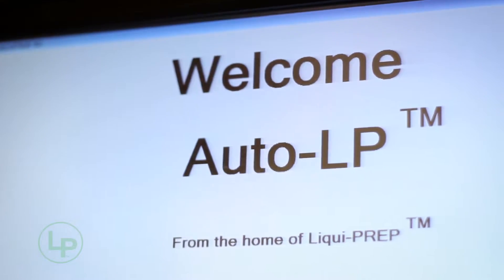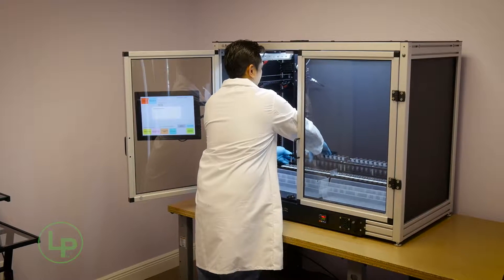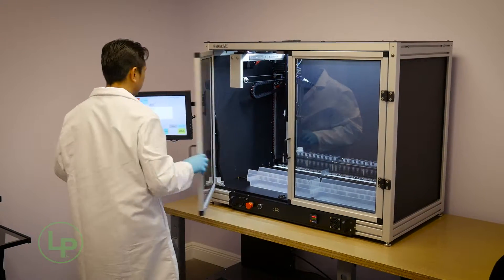expanded to include an automated instrument, the Auto LP. Simple to use, walk away general cytology processing system.